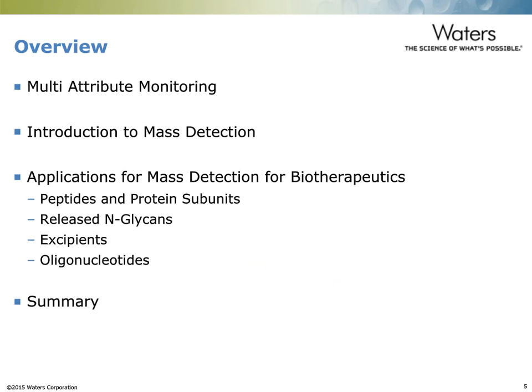So at the outset, an overview of the presentation: I want to begin by discussing what multi-attribute monitoring is, and then transition into a discussion of mass detection and what the AcuityQDA is. Then move into the heart of the presentation, where I'll focus on a variety of applications that we've seen the QDA applied for, both in our lab and in our customers' labs, and then provide a brief summary at the end.